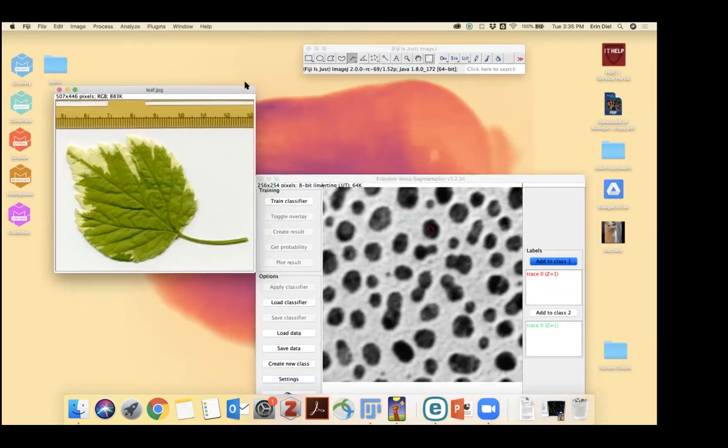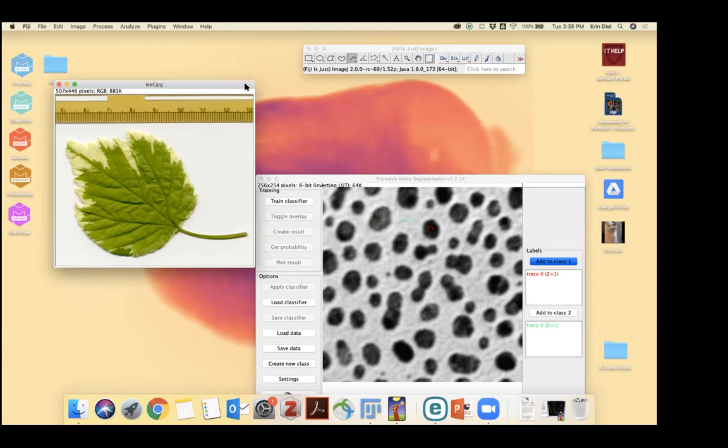color-based segmentation. So for this image, and again, someone asked about this last week. Someone asked about k-means clustering versus this random forest versus other classifiers. And in this image, you could imagine a scenario where I paint, this part is green and this part is sort of whitish, but this background is really white, and then this ruler is sort of brown.